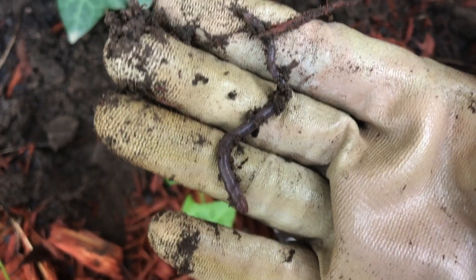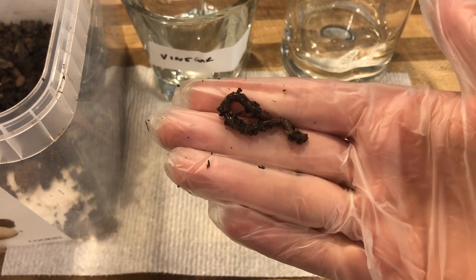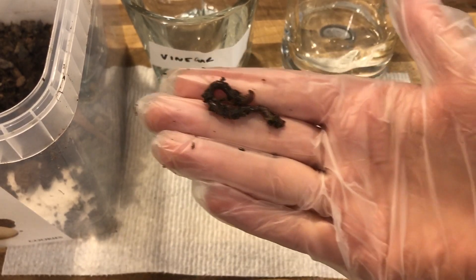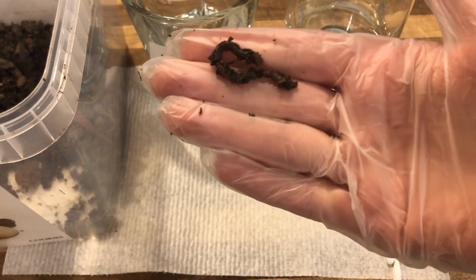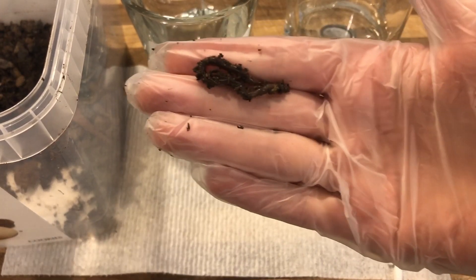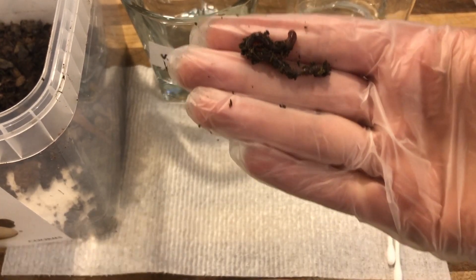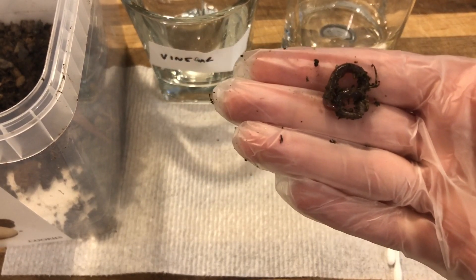There we go. Welcome to our earthworm observation and inference lab. Earthworms belong to the phylum Annelida. Annelids can be terrestrial, freshwater, or marine, and they vary in size from a few millimeters to over a meter. One of the cool characteristics about earthworms is that they have metamerism — their body is divided into several different parts or segments. During this lab, we're going to practice observation and inference and look at some of the many characteristics of organisms in this phylum.